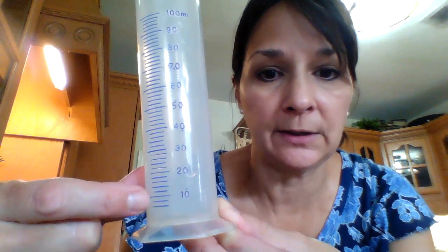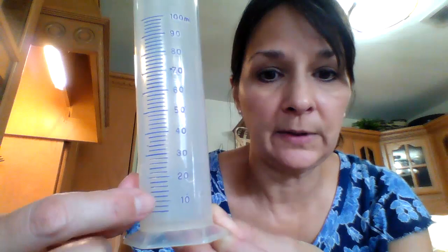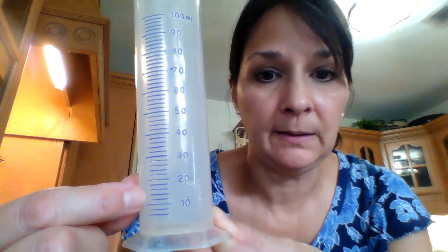So one thing that you can do is count your number of lines from one 10 to the next. So we'll start down here at 10. You see this long line here is where the 10 begins, okay? So from the 10 up to the 20 right here, we've got 1, 2, 3, 4, and 5, okay?